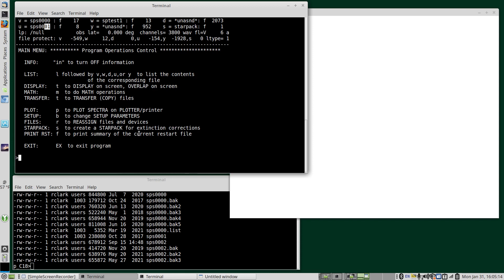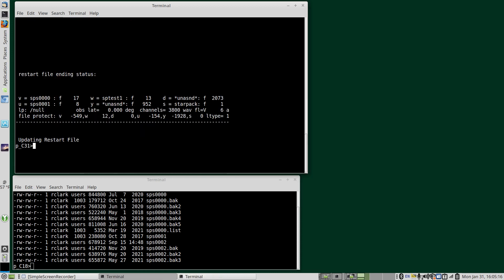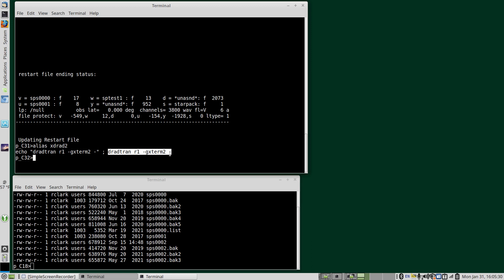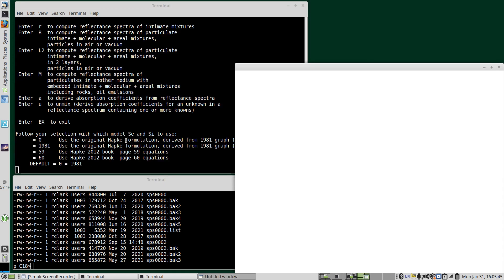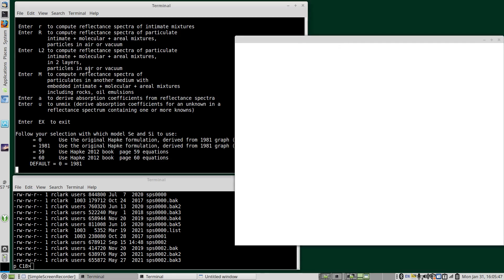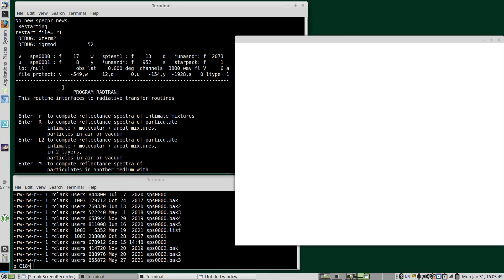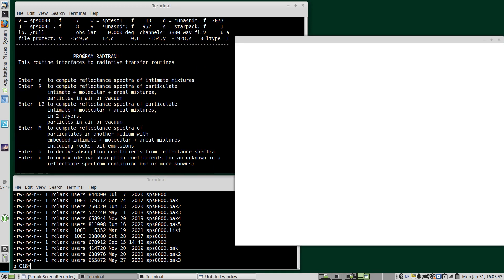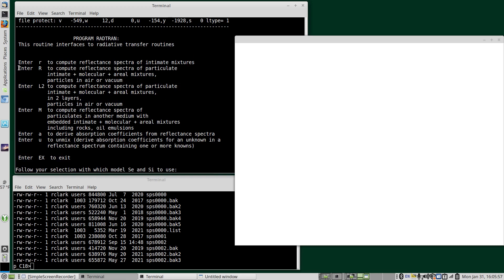And we can go ahead and start RadTran. I have an alias set up so I can quickly start these programs. So starting RadTran, restart file, the X terminal, X window size if you want something larger than the default. Okay, so we see that we have our files assigned. There are multiple options here for computing reflectance spectra of multi-component mixtures.